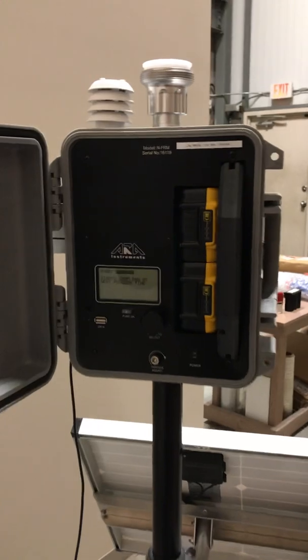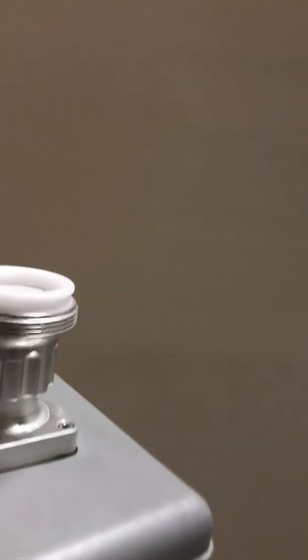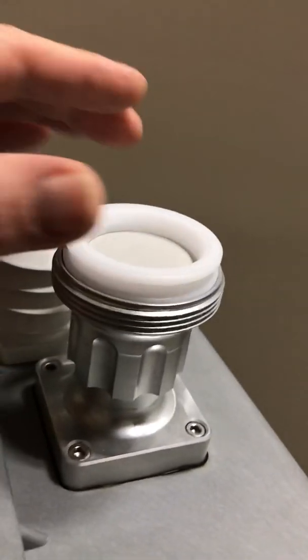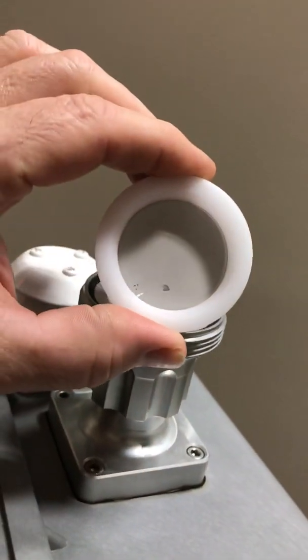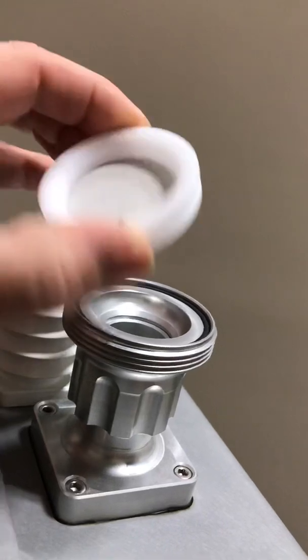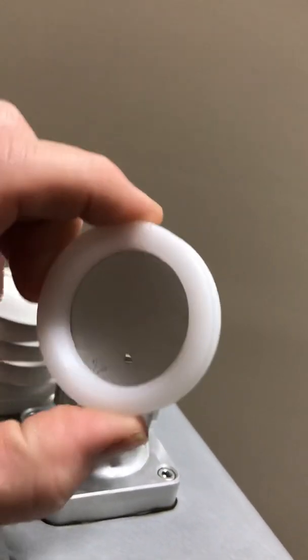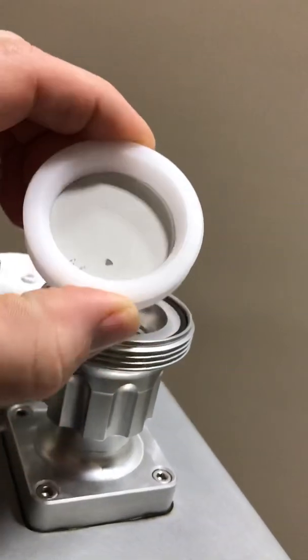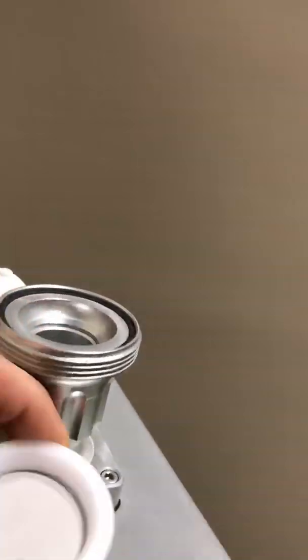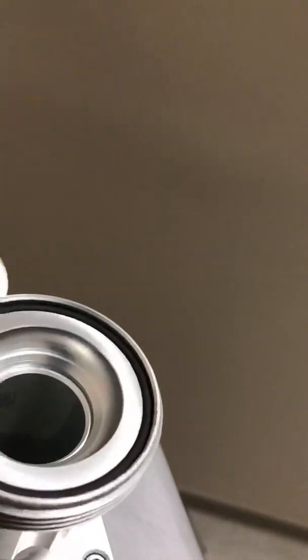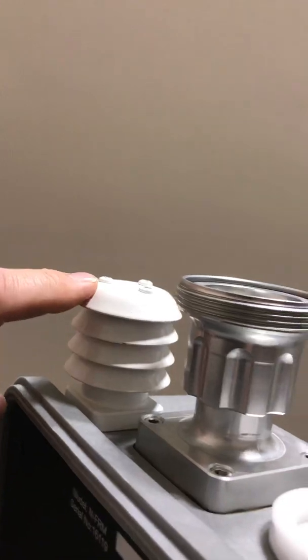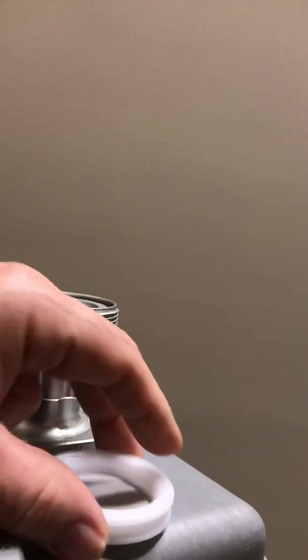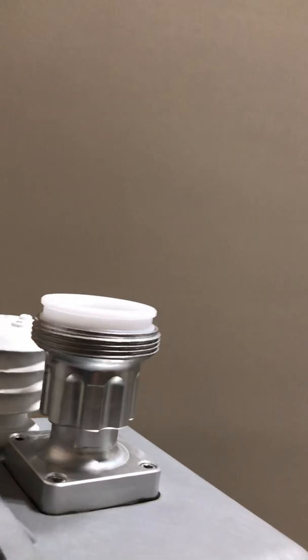This unit, as I mentioned, the filter is right here. This is the 47 millimeter filter style commonly seen in the NAPS program. You can see the filter just sitting inside there, the back screen, and air passes down through into the bottom of the unit. This is a temperature sensor right here, and that is the standard 47 millimeter filter.